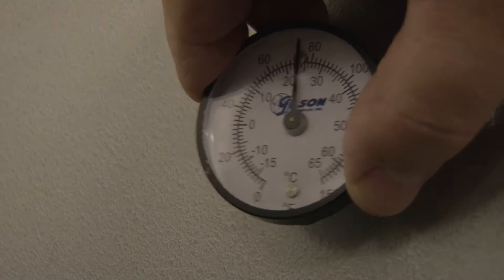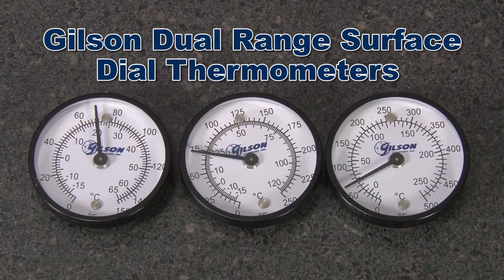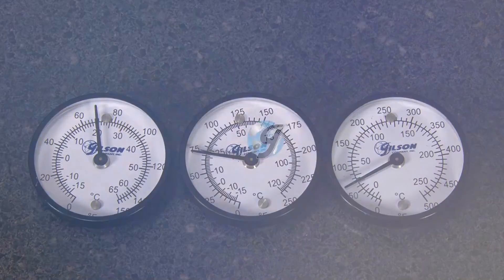Dials are 2 inches in diameter with an accuracy within 2% to make the Gilson Dual Range Surface Dial Thermometers the right choice for your material testing lab.